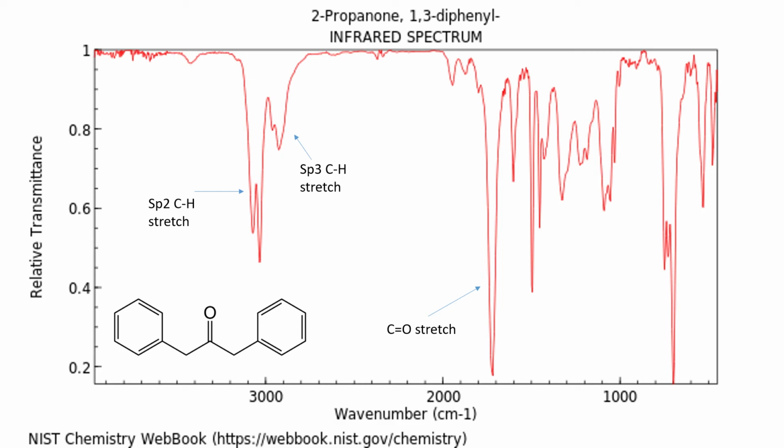So once you collect your product, the next thing you want to do is make sure that you actually have a pure product, or that you actually collected what you were expecting. So the first thing we would do is check it using infrared spectroscopy. So here I have the molecule. There's three functional groups that we should be able to see easily.